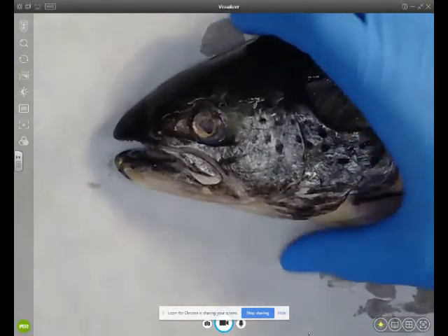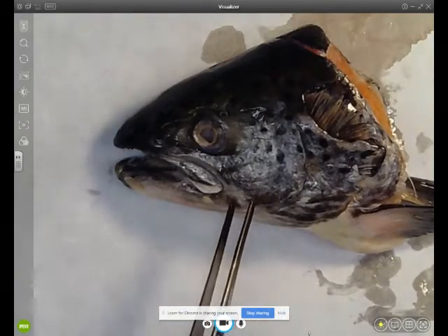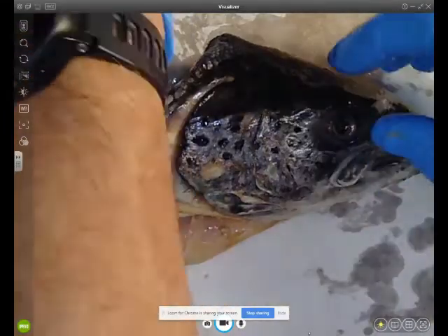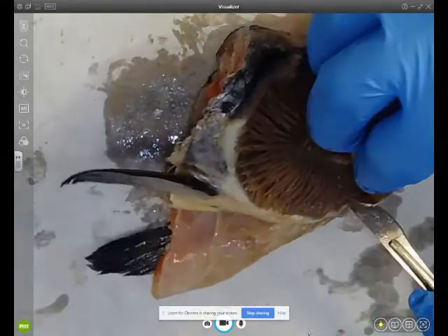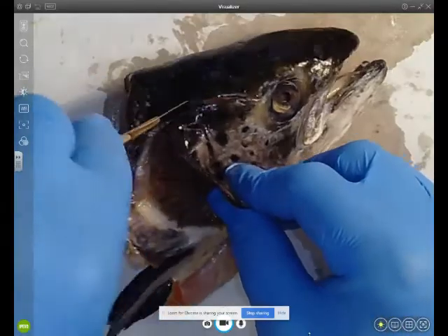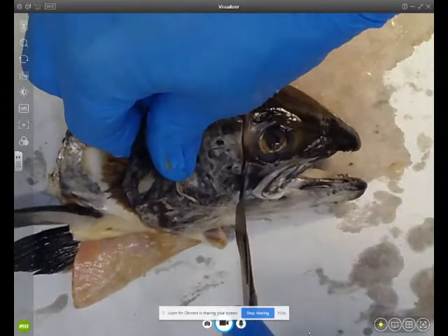Covering the outside of the gills is the operculum. This is a bony piece on the outside of the head — it's a flap. I've swapped over the head to the other side and underneath the flap are the gills. What I'm going to do now is cut the operculum off.